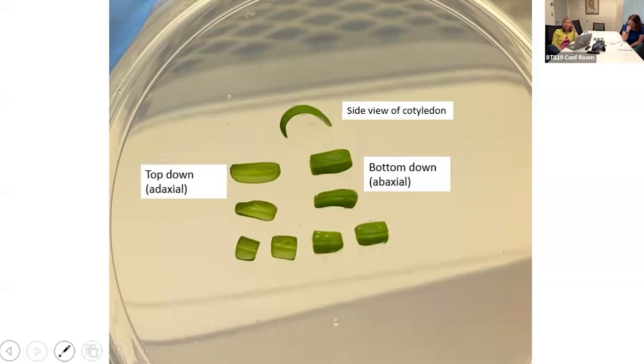Yeah, so about the protoplast, I have experience with protoplast from VFNT cherry that worked really well. I haven't used other tomato lines and I haven't looked in the literature to see what people have done. But for my graduate work, I worked with just that one tomato line, VFNT cherry, doing protoplast, and it worked well from VFNT cherry. And sorry, what was the other question you had about transforming? I didn't catch it.